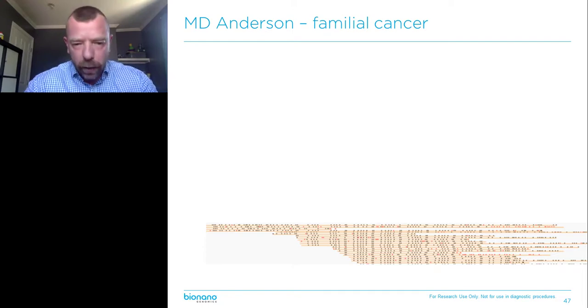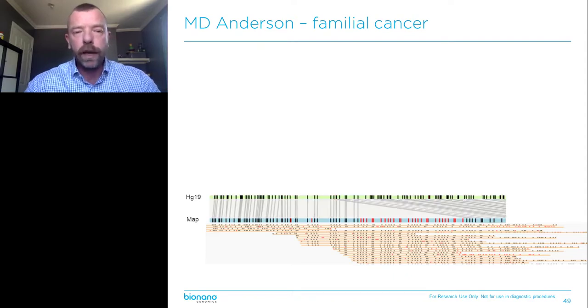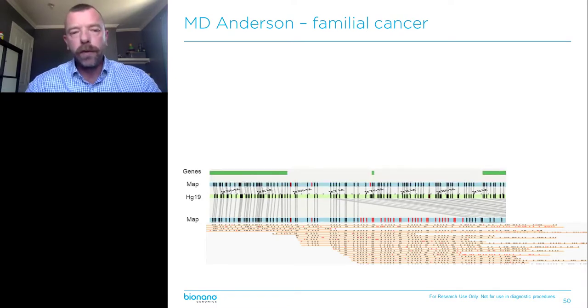Here we're looking at a small part of the genome where we image some molecules. And if you look at these molecules, you see some patterns on there. So we build a consensus genome map that represents the average spacing of these labels detected on all of these molecules. When we align that to HG19 or another reference genome of your choice, you see that there's a perfect alignment on the left. Something's going on in the right half. We also assembled a wild type allele. Of course, human is a diploid organism, and so we expect 2 alleles. And that one aligns perfectly with the reference.